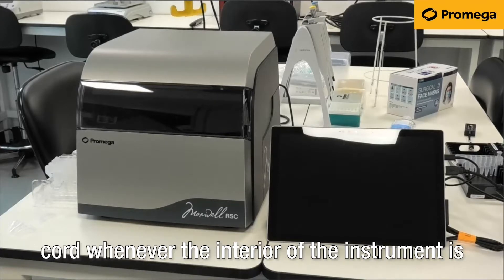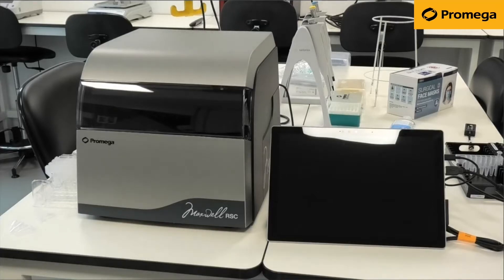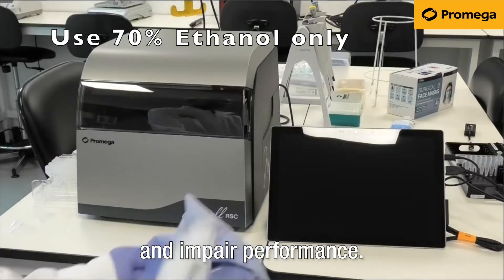Power off the instrument and disconnect the power cord whenever the interior of the instrument is accessible for cleaning and maintenance. When cleaning the Maxwell, only use 70% ethanol. Other solutions may damage the instrument surfaces and impair performance.